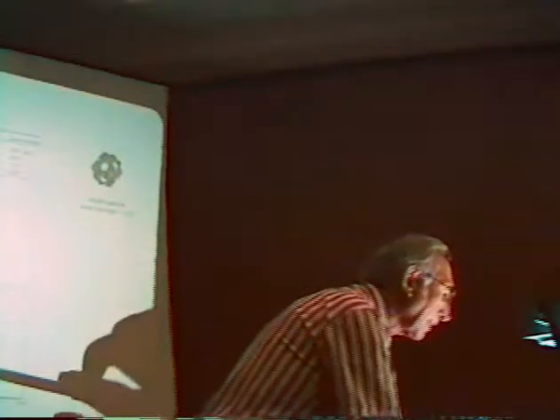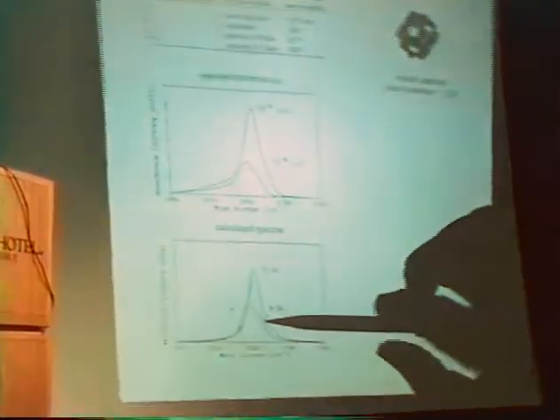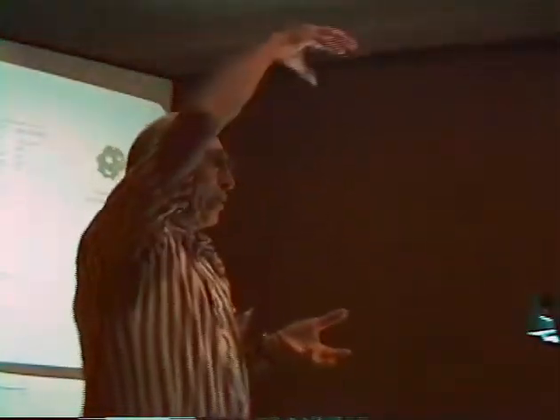I think I said that wrong. The higher mode is the in-phase mode. The strong mode here is the one where those in the upper hemisphere are going up and those in the lower hemisphere are also going up. That is, some of them are out of phase with the others.